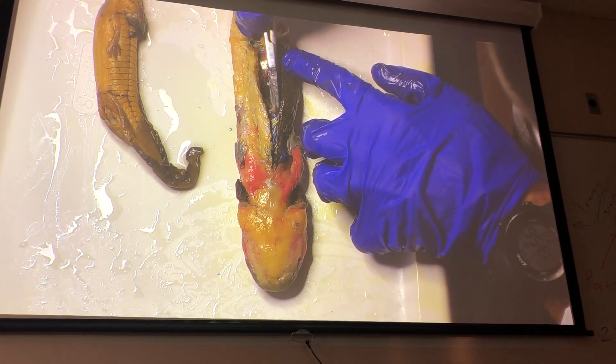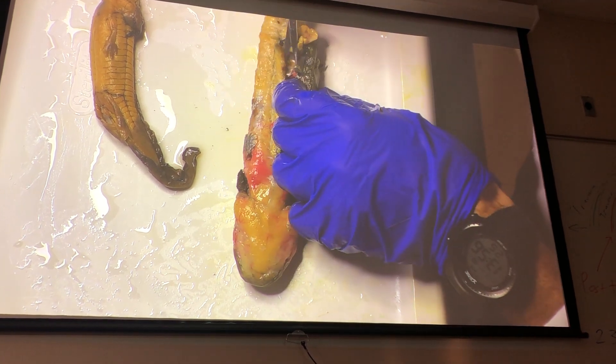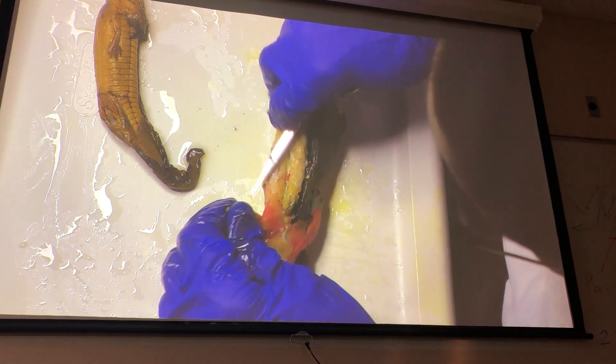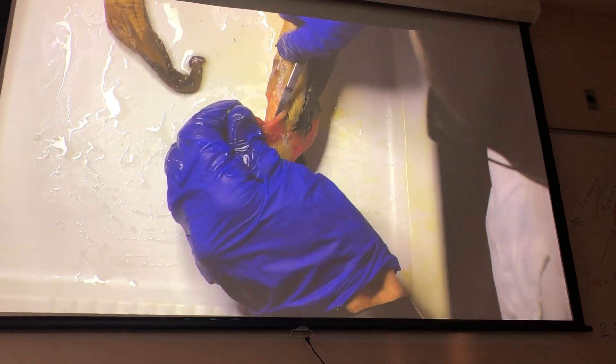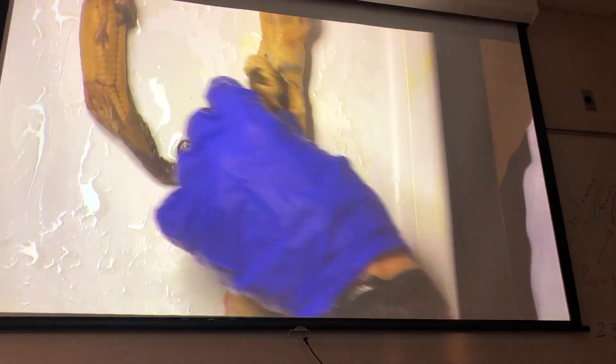It takes little time to clean this, just a lot more time trying to identify things because it's all so tiny and compact. Eventually you're going to come out onto the arms and clean away the blood vessels on the arms and the legs so you can see those. All right, so that's the mud puppy.